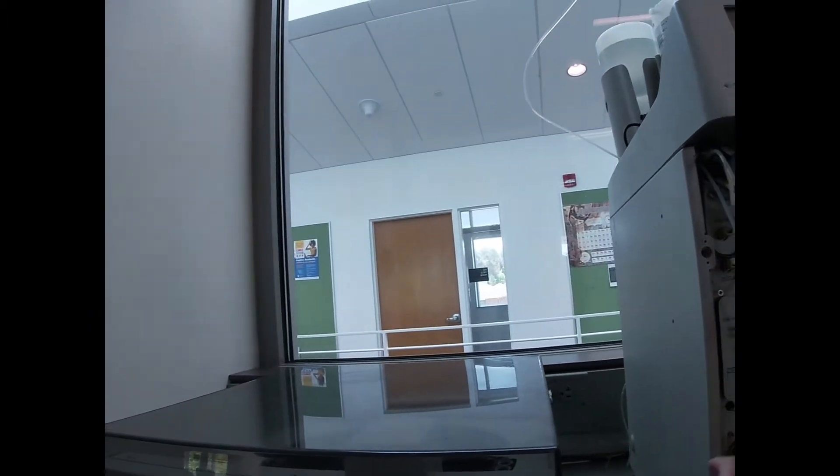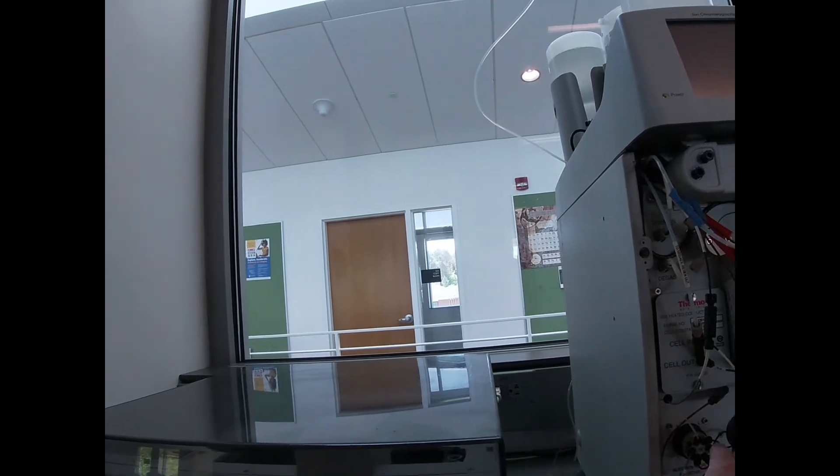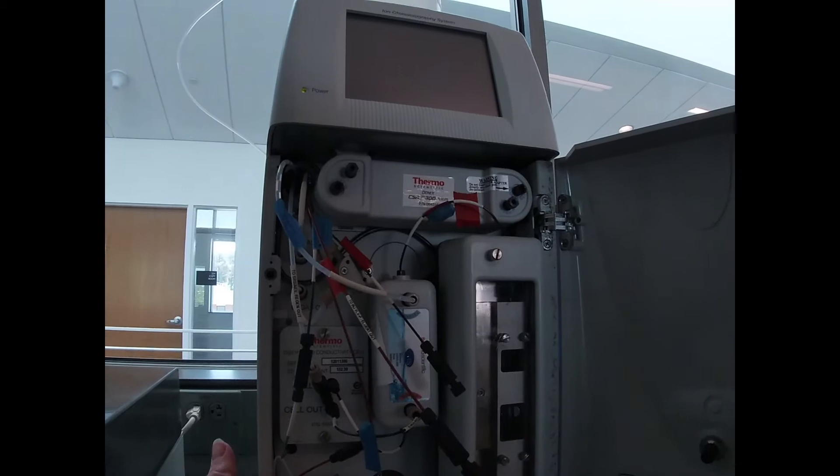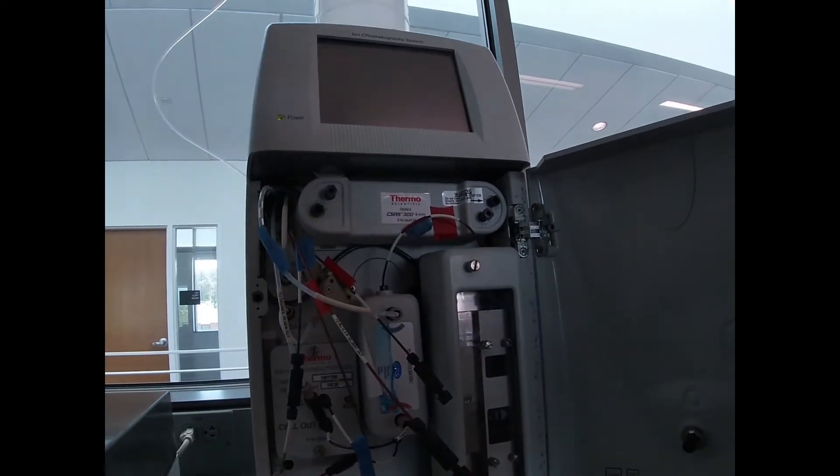So our sample comes in here to our sample loop. You can fill this loop with sample while we're actually pumping our eluent.